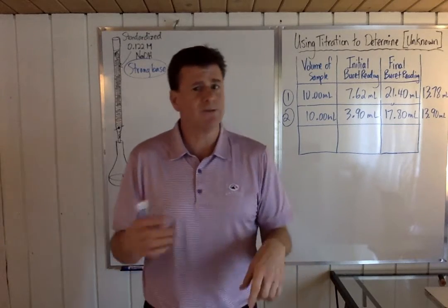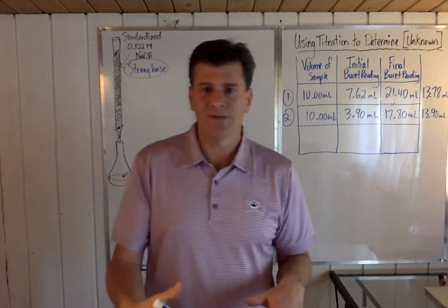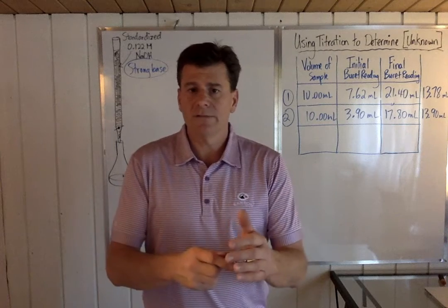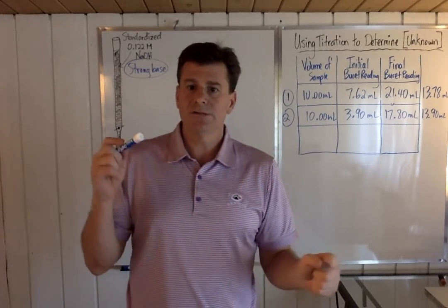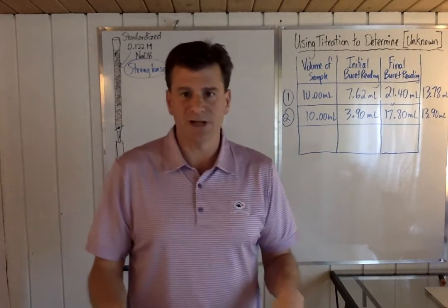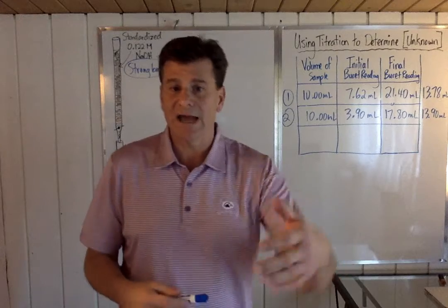Okay, so 0.14 of the average is actually quite a small, narrow range. Plus or minus 1% is actually quite precise. Your teacher may not require that level of precision. These both are good titrations. Okay, so they're good trials. I shouldn't say they're good titrations. They might have had perfect technique and it went weird. They are good trials, so they're close enough together that I can now stop.